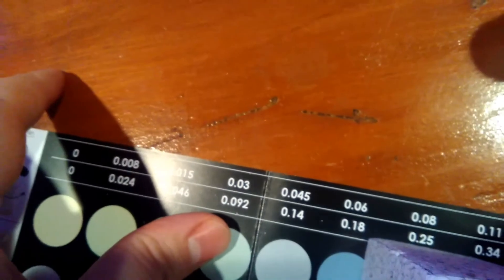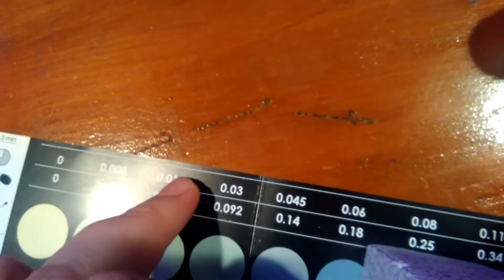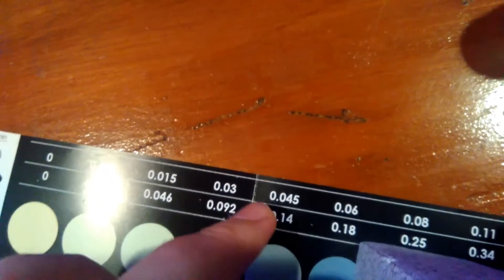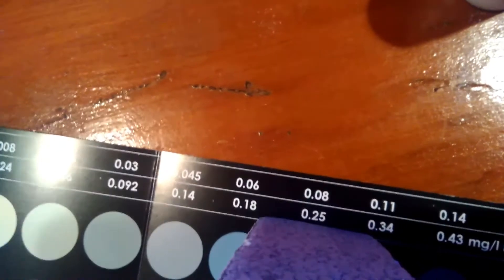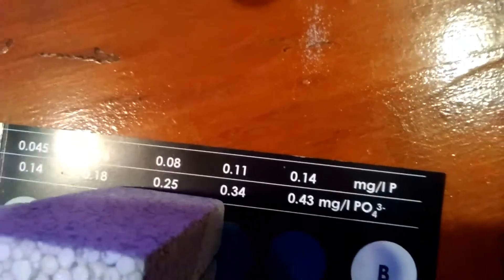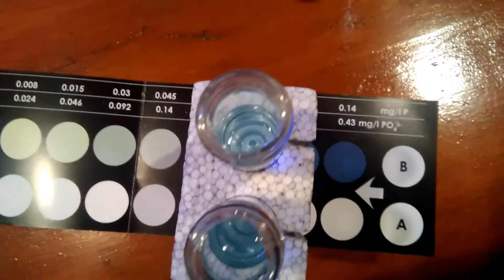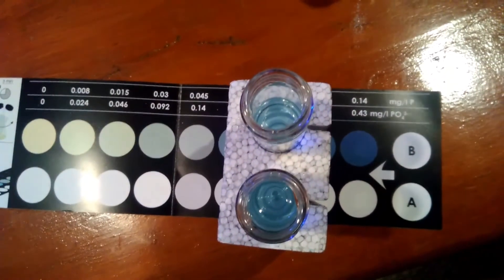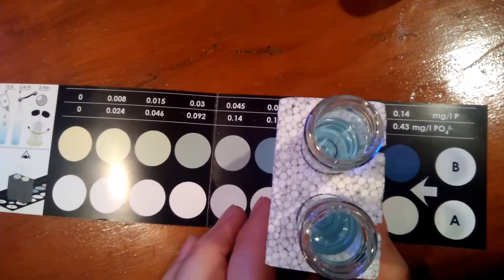The scale values you can read are: 0.008, 0.015, 0.03, 0.045, 0.06, 0.08, 0.11, 0.14. It takes three minutes for this to give you your perfect test results. This is also NIST certified — that stands for the National Institute of Standards and Technology.